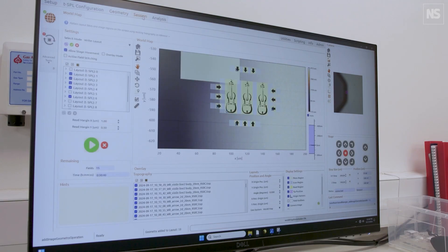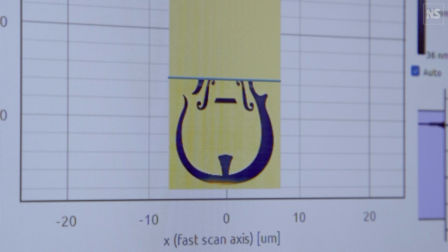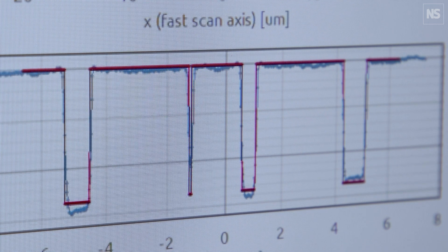We take this chip and then put it underneath the nanofraser, load our pattern in the nanofraser software, and then set the parameters so that the small tip, which gets hot, writes the violin pattern into the polymer.